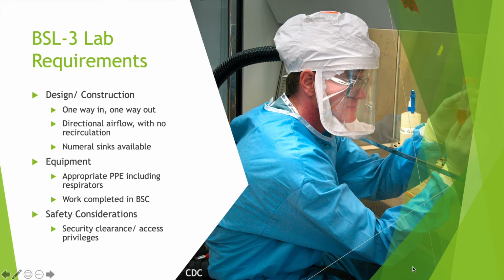Since this level is considered a high containment zone, the goal is to keep pathogens in the lab. So, what's inside should not be able to leave, and since most of these microbes are airborne, these precautions prevent just that. As far as infrastructure goes, the building and/or lab access is strictly controlled and surveilled. In a BSL-3 lab, there are typically two auto shut and locking doors. One is used for entrance and the other for exit. All non-authorized entry is restricted.